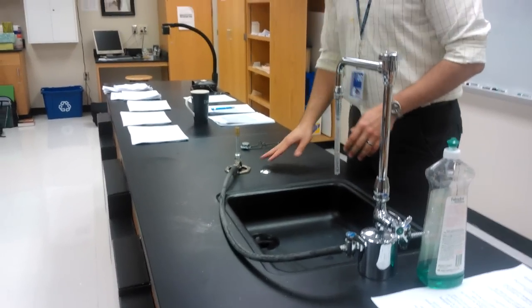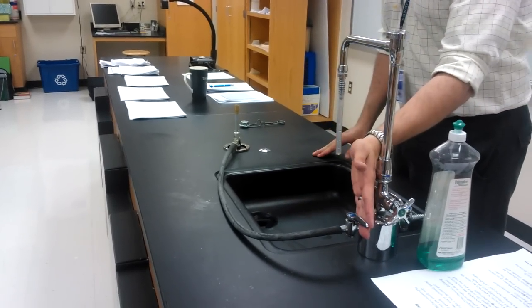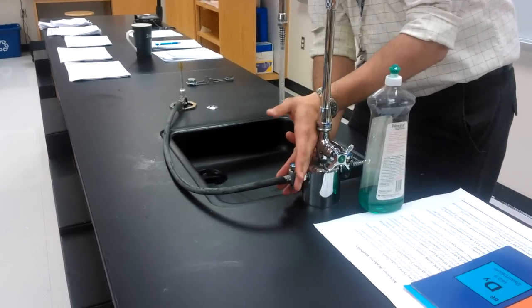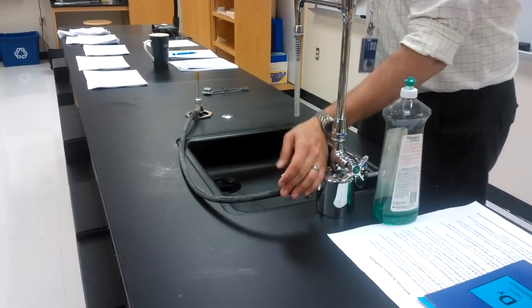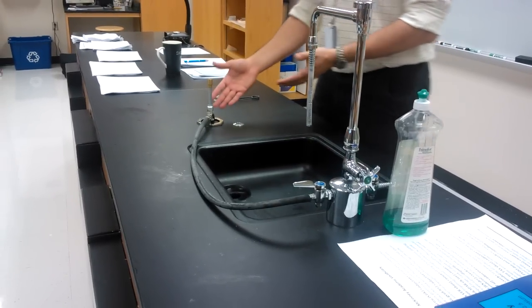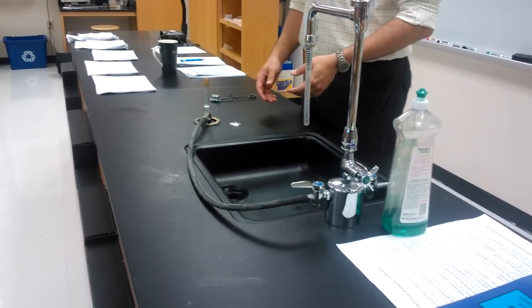Alright, the next step is I'm going to turn on my gas. I'm going to make sure that my gas is completely parallel with the nozzle. My gas is fully on but notice that I don't hear anything. That's a good thing. No gas is coming out. That means we did a good job closing the Bunsen burner.